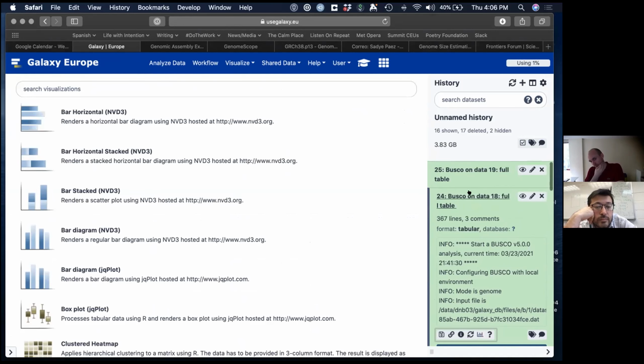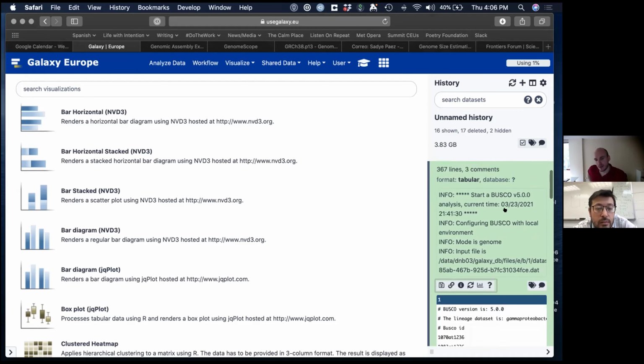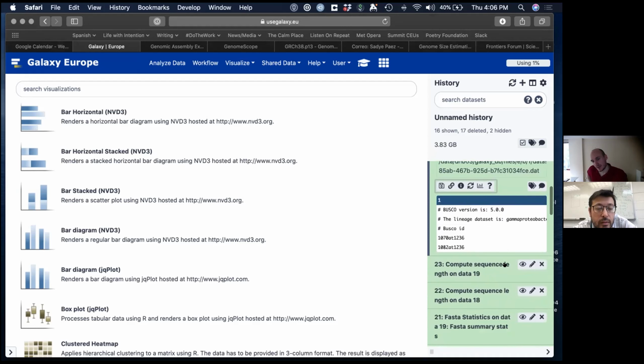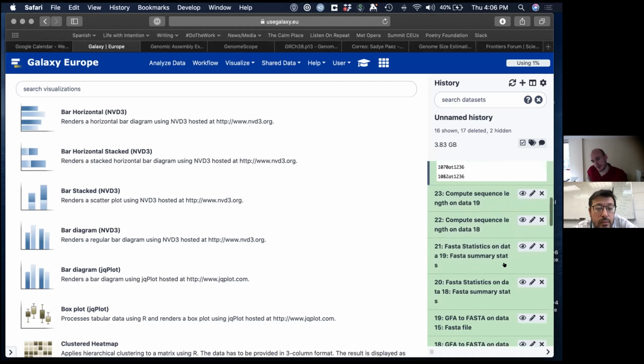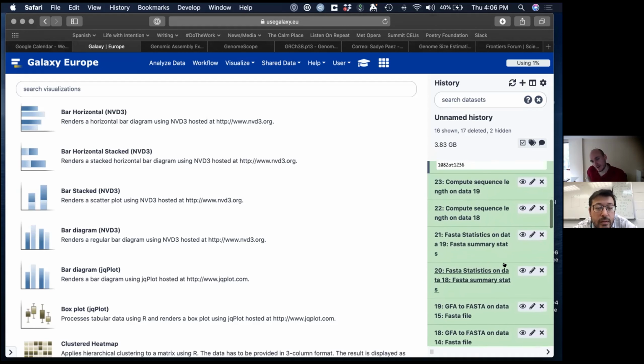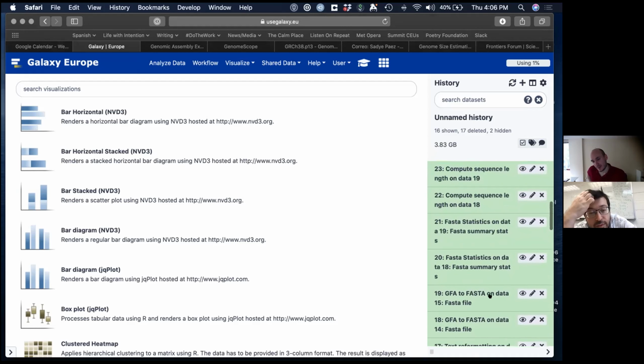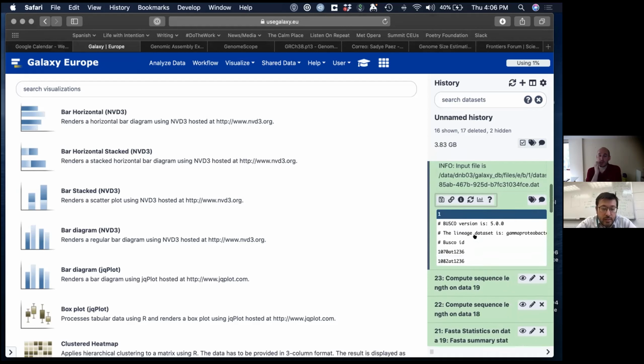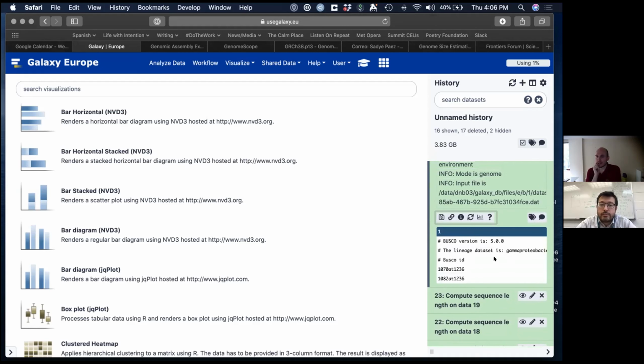It should say summary, maybe scrolling down. Keep going. Summaries. No. Oh, it's a different thing. Maybe I missed a step. Normally it should be there. Maybe you deleted it by mistake.